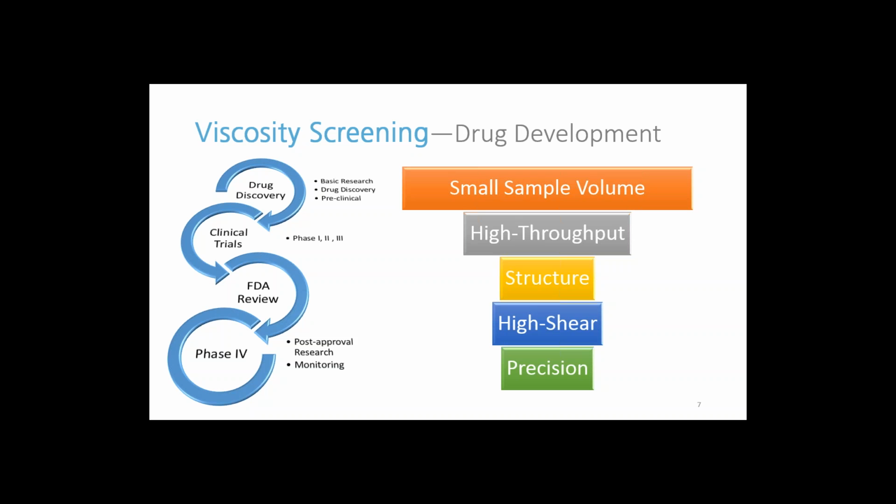You're going to want to be able to get your formulations characterized using very small sample, or as small as you can. You might also want to be able to recover that sample to do some additional testing. And you're going to want to be able to test a large number of samples. And if possible, you will want to test those in a high throughput, time efficient, and unattended manner. What you want to study is, at the end, the structure of the different active ingredients or the different proteins that you have in your formulations.